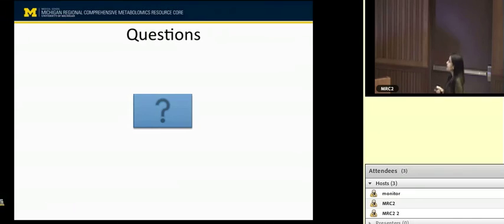So for the second experiment with LCR, HCR, where we have three age groups, basically the young, mature, and old animals. As you can see, the biggest separation here is on age. So these are all on the PC1 axis towards the right side. These are all young animals, both LCR, HCR young animals. And then on this side are all the mature and old animals. So these ones right here are the old animals, and these ones over here.